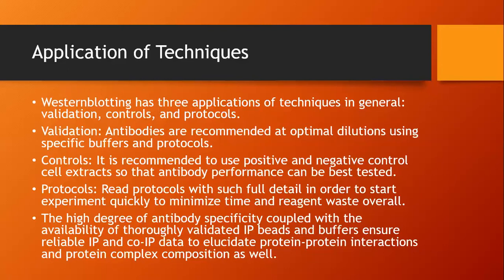And finally, let's talk about the protocols for immunoblotting. It's really crucial to read the protocols in full detail in order to start the experiment quickly and to minimize time and reagent waste overall. So it's important to waste no time in this kind of experiment, and to get the best results possible.